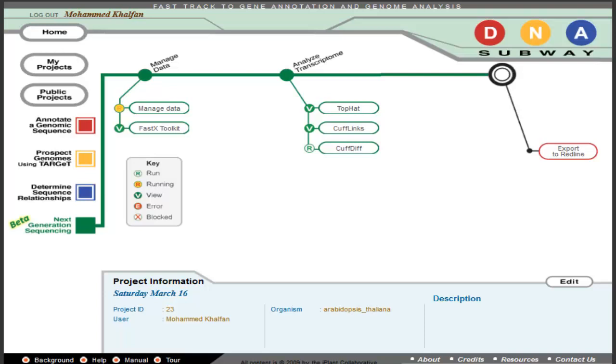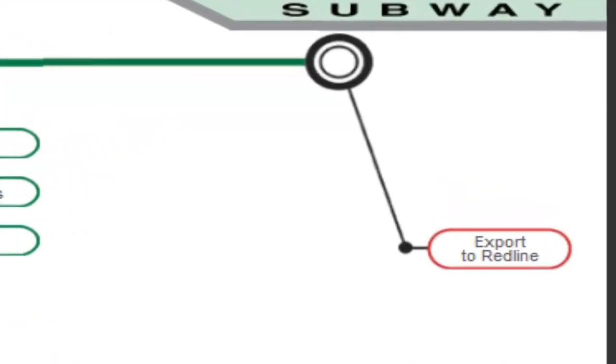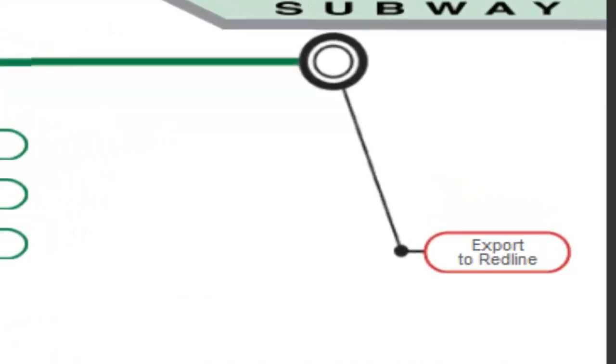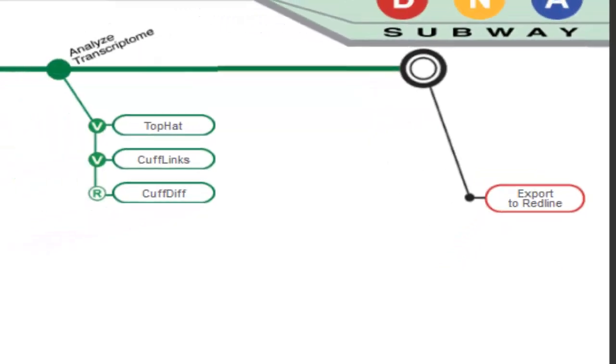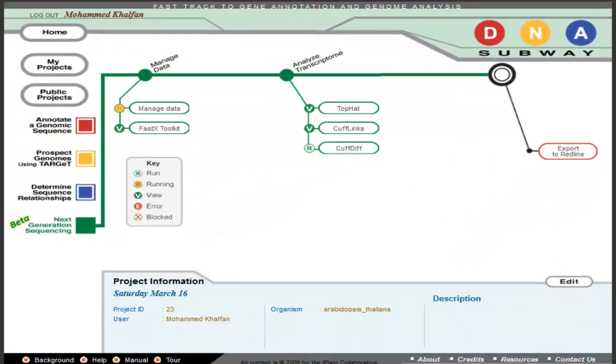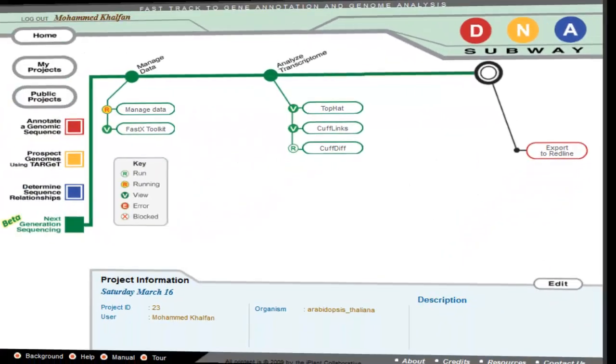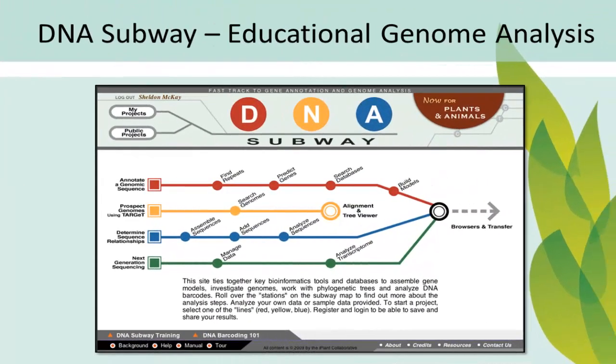Finally, the results of your analysis can be exported to the red line, where RNA-Seq data can be used as a class of evidence in annotating genes. DNA Subway, a smooth ride to RNA-Seq analysis.